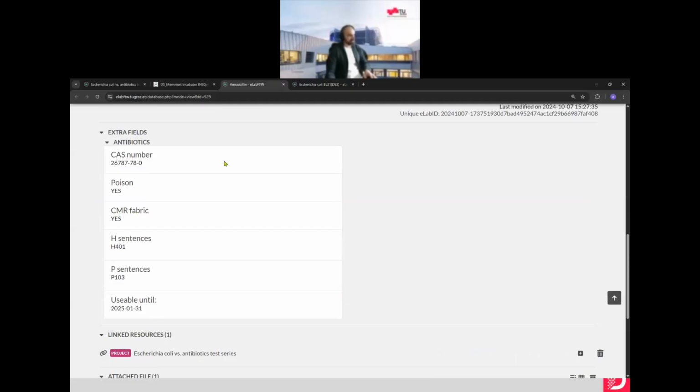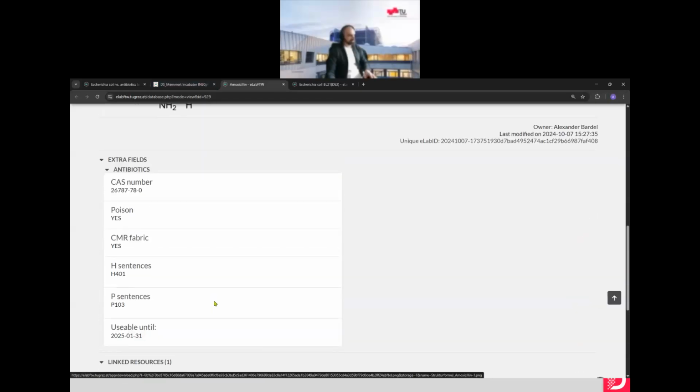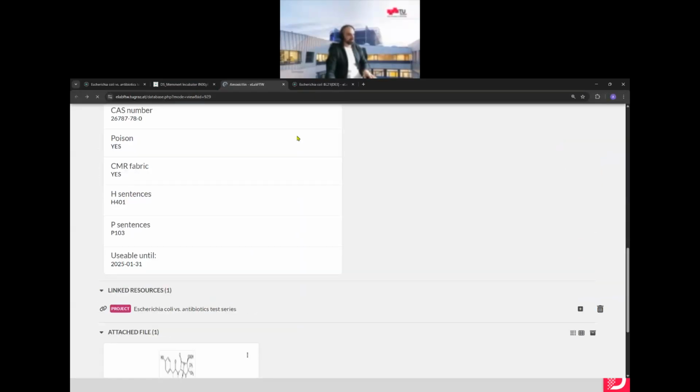So all of these things were explicitly mentioned by my group lead. And also the attached file, so this is the image that is displayed here. And here I could also go back to my project again if I want.